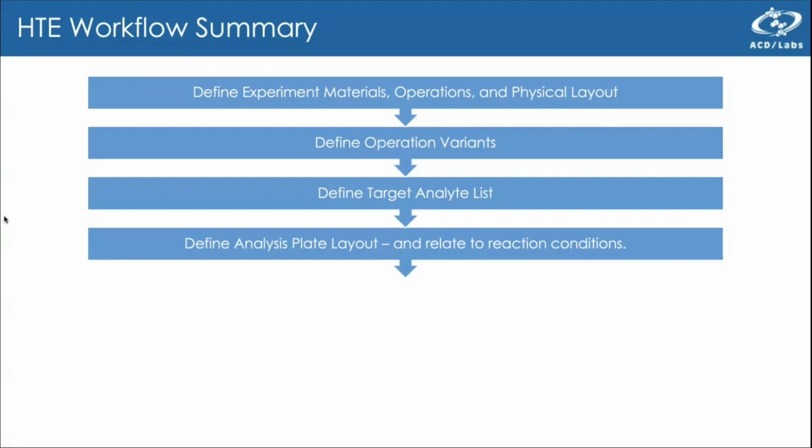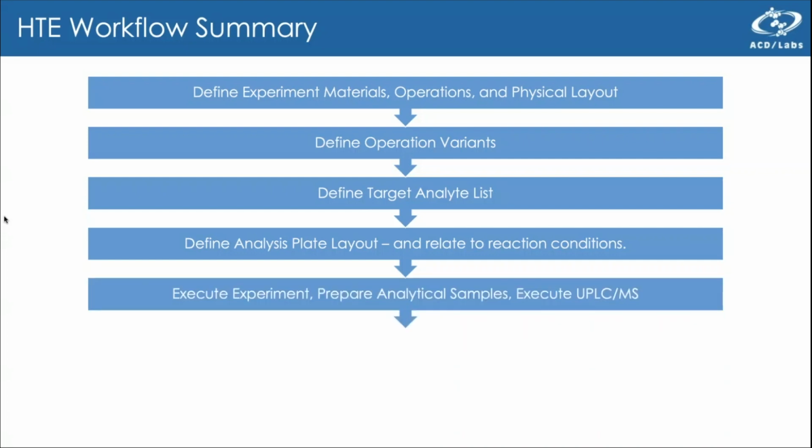We'll also need to define, in addition to the physical layout of our experiments, our analysis plates that will usually prepare samples from our reaction materials and generate analysis samples. We'll probably need to define the layouts of those analysis samples and ultimately be able to relate our analysis plate information back to our reaction information.